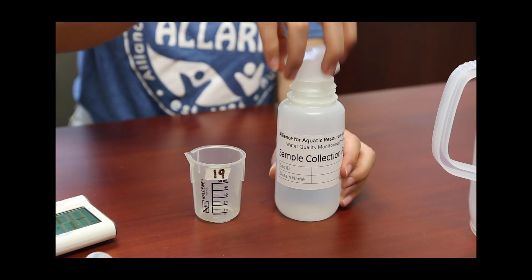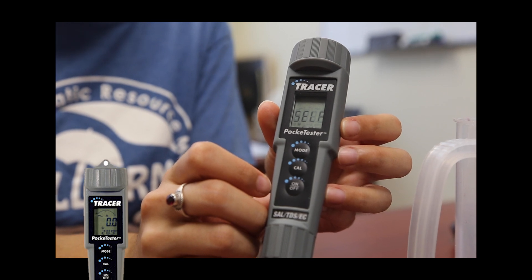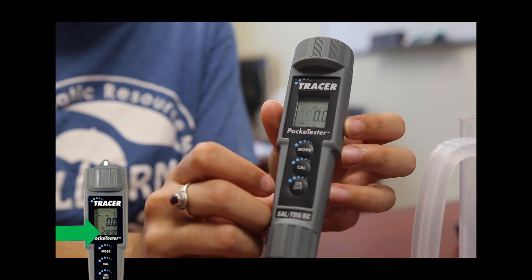You can test for temperature with your Lamont Tracer Pocket Tester. The reading will show in the bottom right corner of the meter's screen.